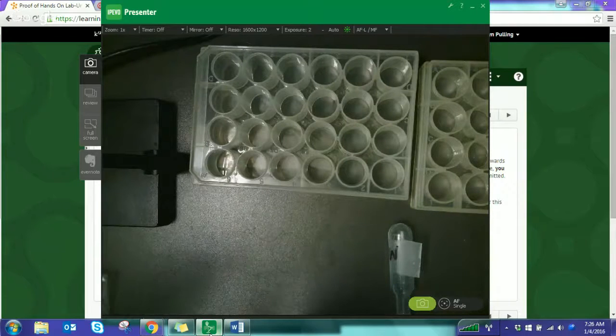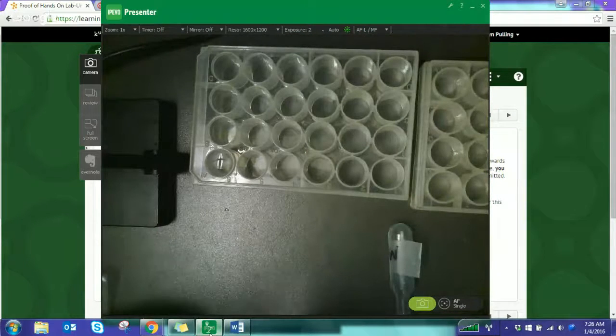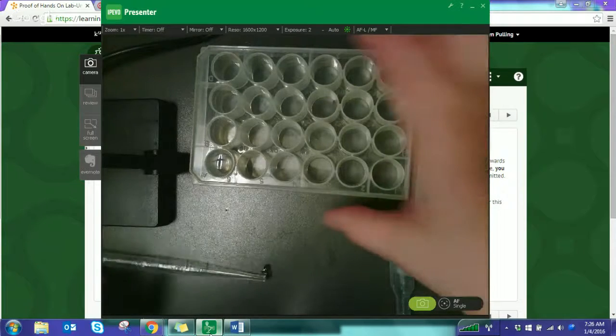Half of my pipette of alcohol. All right, and then I am noticing an issue here. The fact that my vial is now full, or my well is completely full, which is actually going to be too much liquid.